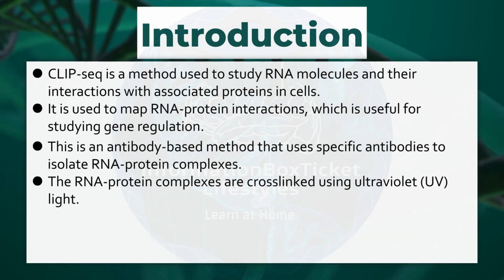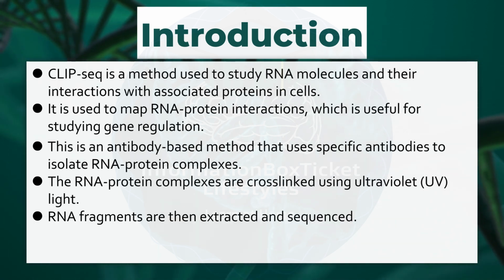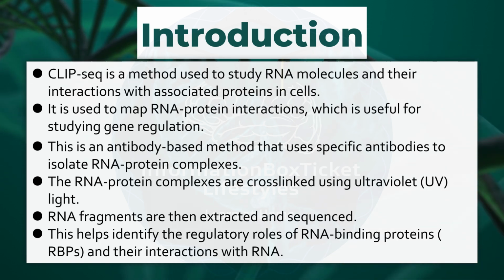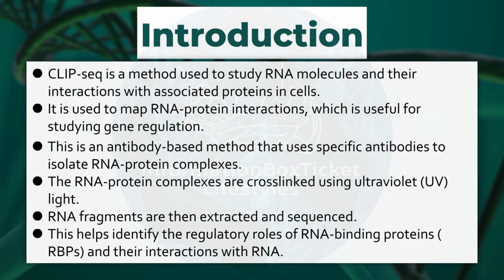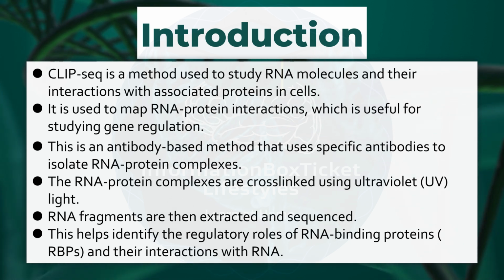The RNA-protein complexes are cross-linked using ultraviolet light. RNA fragments are then extracted and sequenced. This helps identify the regulatory roles of RNA-binding proteins and their interactions with RNA.